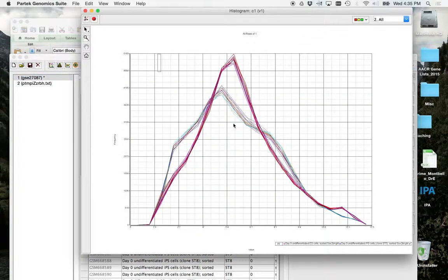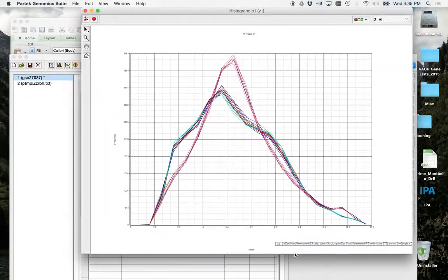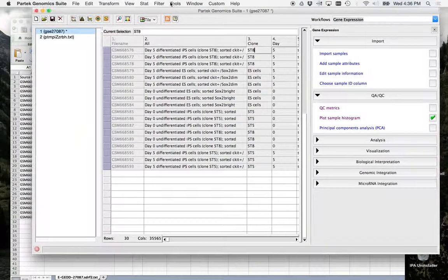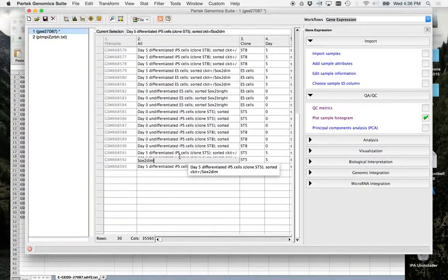And then obviously we have this group here. When you put a box around something, I've got to do it from a distance. When you see that you've got two different populations, we're going to take a look at it on the PCA, and you're going to see exactly what I mean. All right. So now let's go to the second one, principal component analysis.